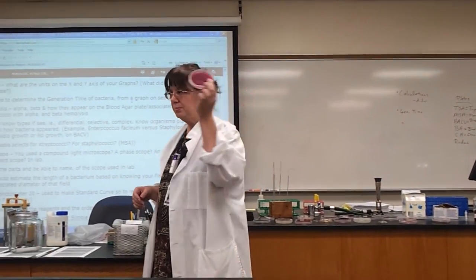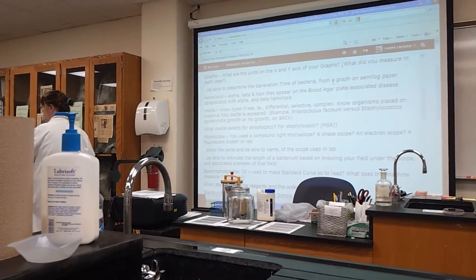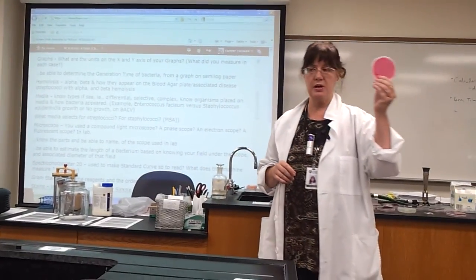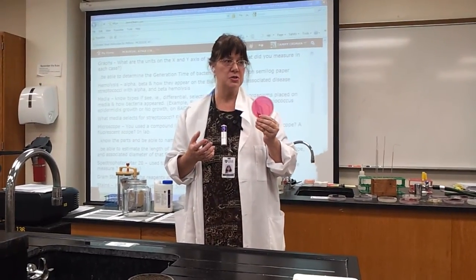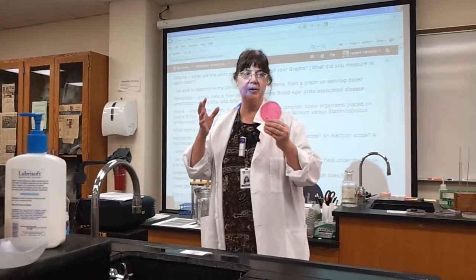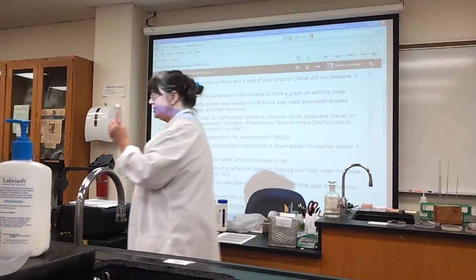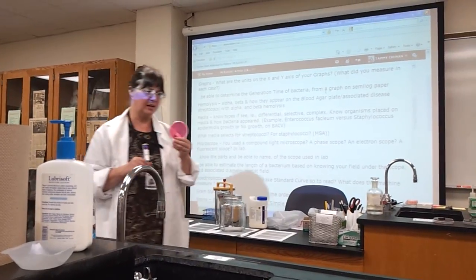Pink. Artificial pink. What type of plate is this? Mannitol salt agar. Now, one of your cultures grew and one did not. But you streaked from the master culture. What grew? Staphylococcus epidermidis, because it is salt tolerant. Because the whole lab was about telling a staphylococcus from a streptococcus, now called enterococcus. What did not grow? Streptococcus did not grow. Streptococcus faecalis, Enterococcus faecalis.